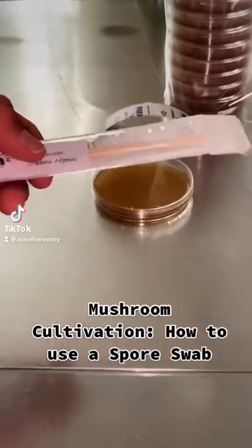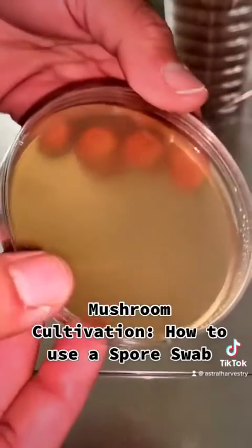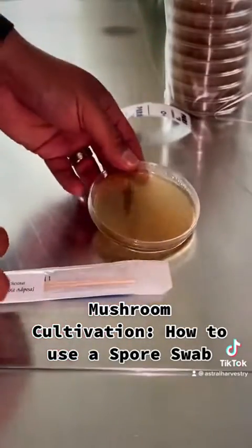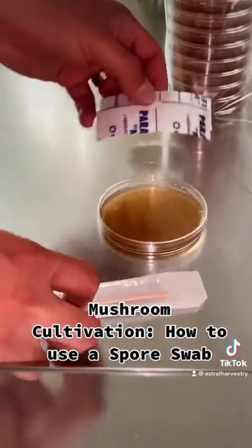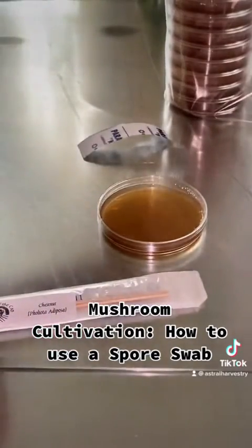Mushroom cultivation: how to use a spore swab. It's very simple. Make sure you have some plates handy — we have some at freshoffthecap.com. They also come with free parafilm strips just like this.